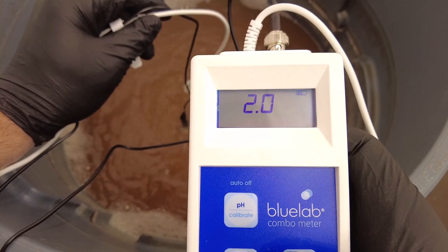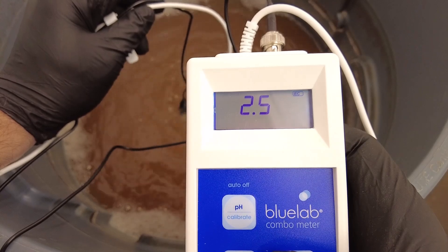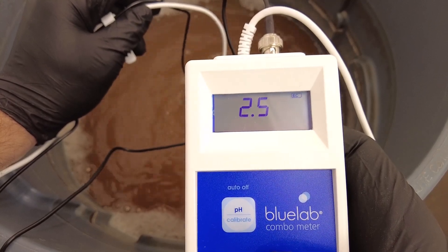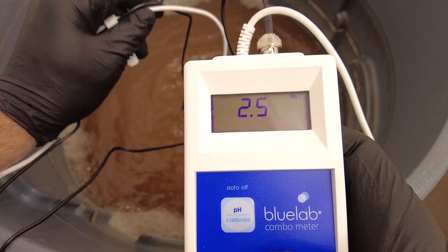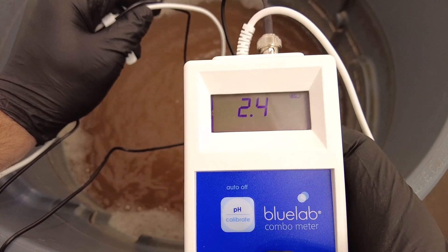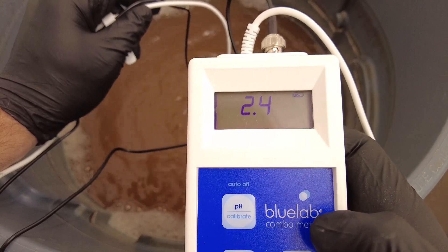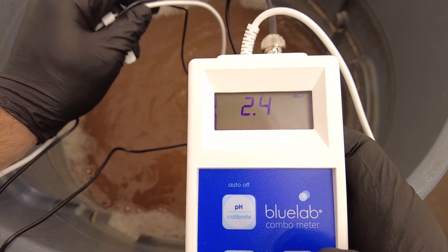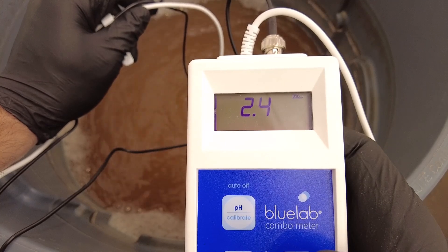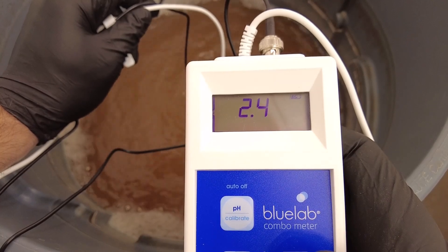Cycling through the readings: we're at 6.1 pH. Clicking over to EC, we're at about 2.5 — that's a heavy feeding, likely from the big increase in nutrients. My other pen was reading 2.2, so that one clearly needs calibration. It looks like it's dialing in at around 2.4 EC for this week five feeding with the Blue Magic Nutrients schedule.